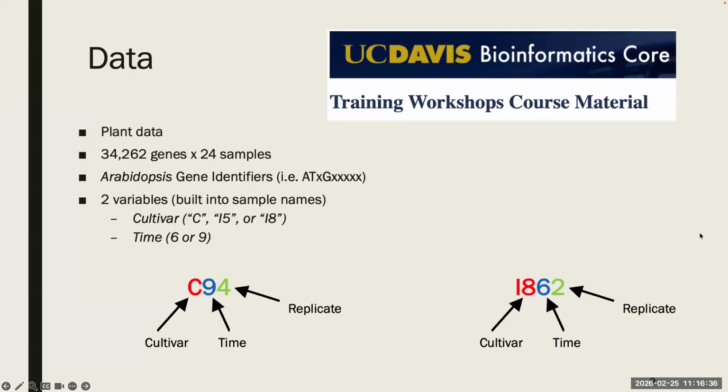Okay, so just to briefly introduce the data that we're going to be working with today. The data is from a UC Davis Bioinformatics workshop. The data is on plants. So in the bulk RNA-seq data, it has 34,262 genes across 24 samples. And the gene identifiers are the Arabidopsis gene identifiers. They come in the form of AT plus a number and then G plus 5 numbers.